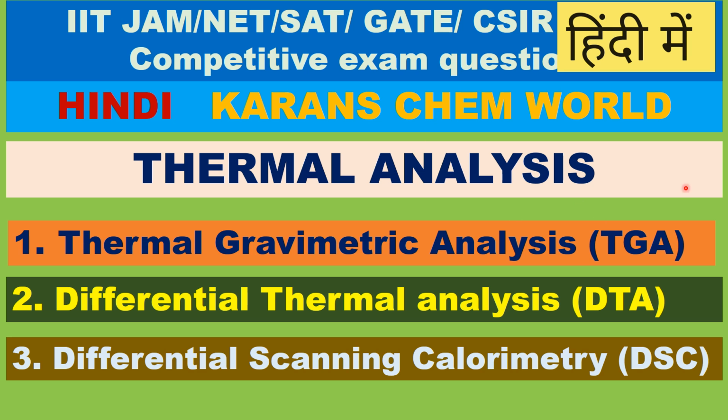नमस्ते, सबको स्वागत है। इस वीडियो में थर्मल एनालिसिस के बारे में डिस्कस करेंगे, समझेंगे। There are three types of thermal analysis: thermal gravimetric analysis or thermogravimetric analysis (TGA), differential thermal analysis (DTA), and differential scanning calorimetry (DSC).